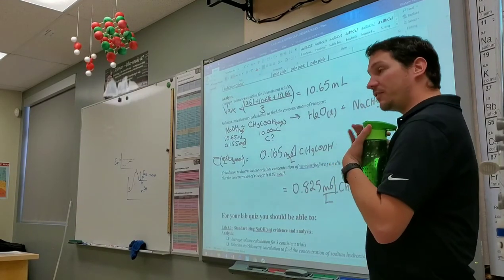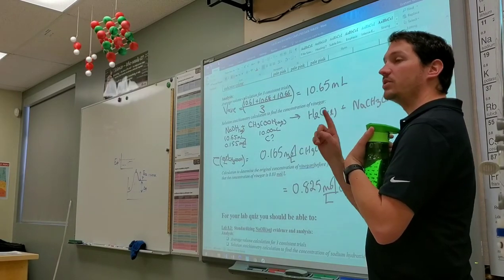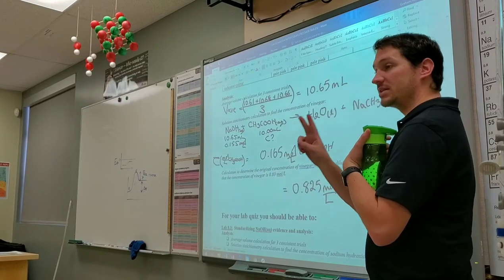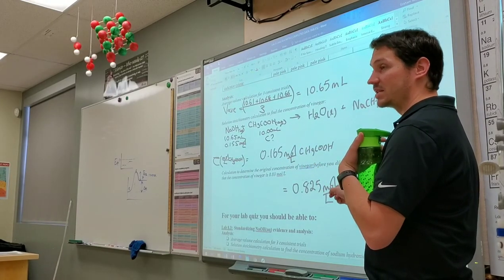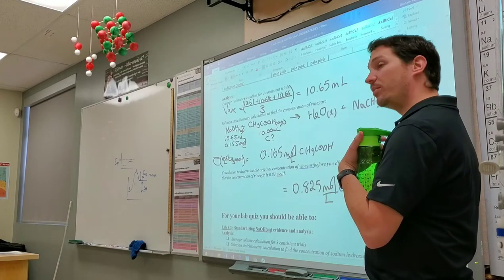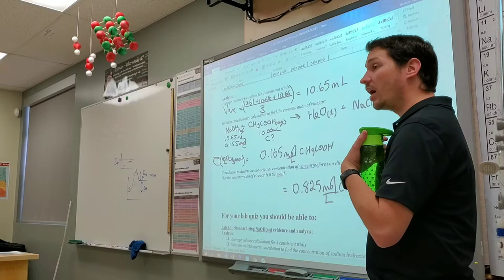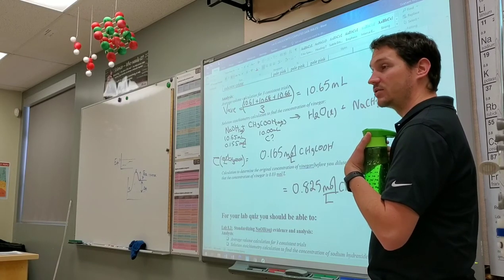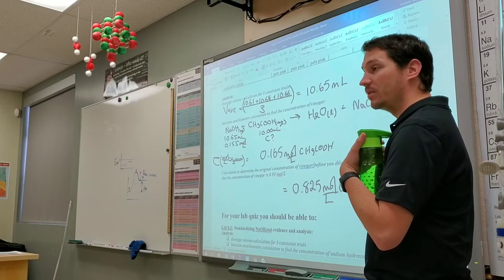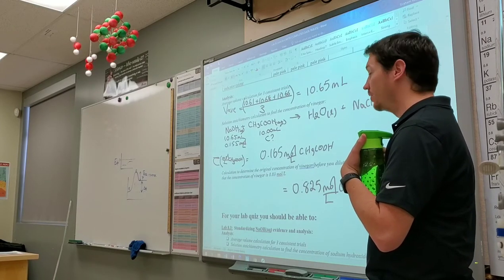And if you would have done the first titration with the same degree of care and quality that you did the second day of titrations, you probably would have gotten pretty darn close to that as well, probably 0.81 or 0.80 or something like that. But I was walking around yesterday and I was seeing a lot of really high quality titrations. I'm really happy with the amount of work that people put in yesterday. So I just want to say thank you.